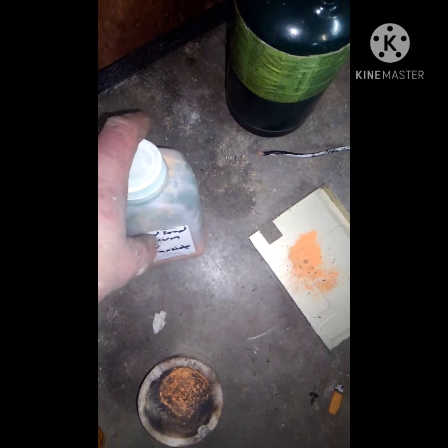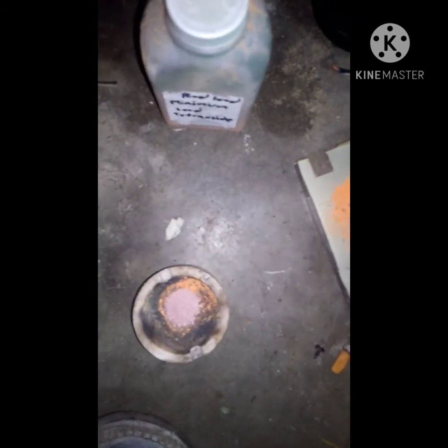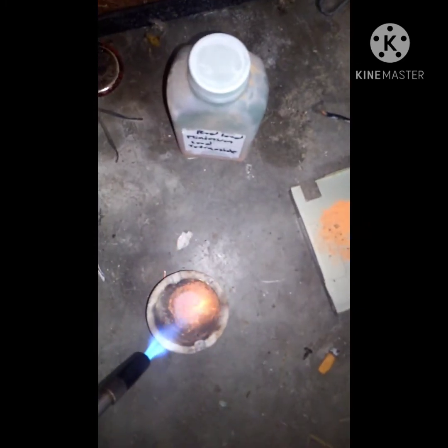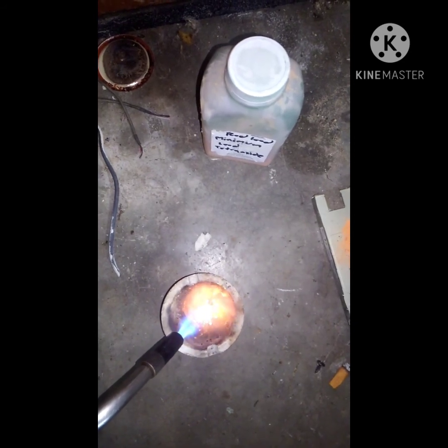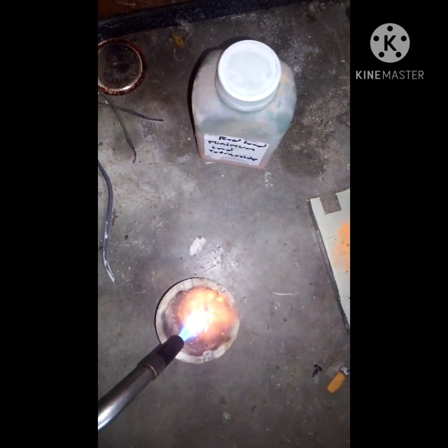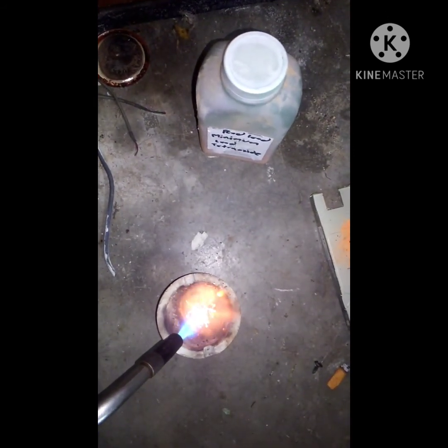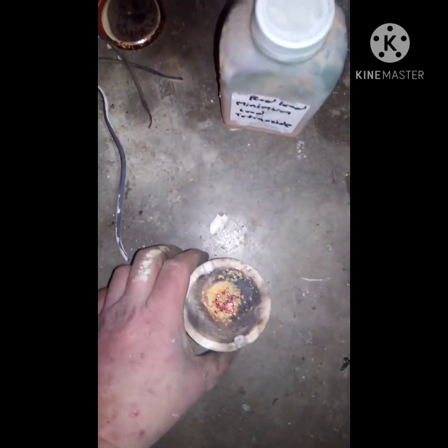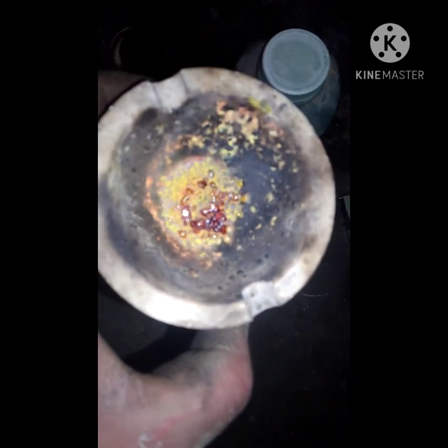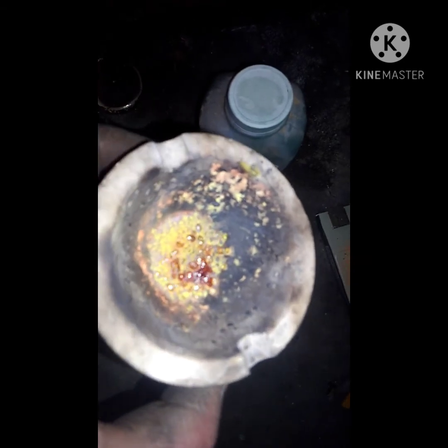So this is lead tetroxide I made through the fire way that I showed how to make it, and then this is red lead I've made through the chemical process that I've showed. Now I'll burn some of this with a torch. You can see it, just like the other stuff, it decomposes to litharge — litharge being the yellow lead.